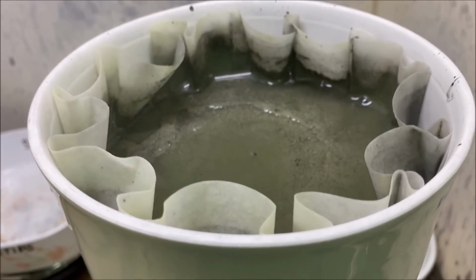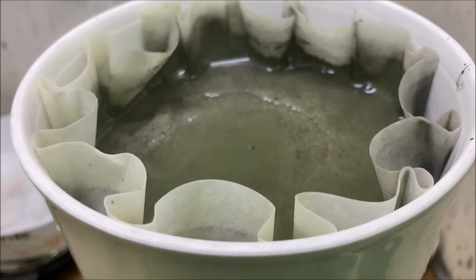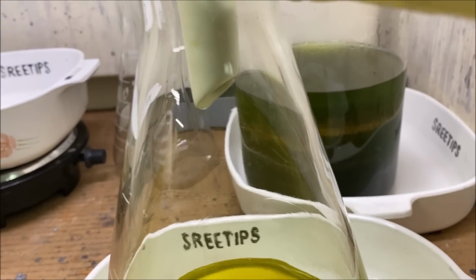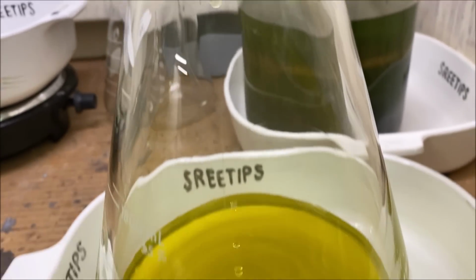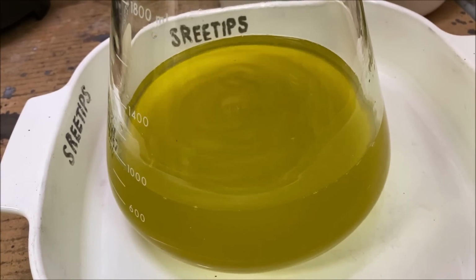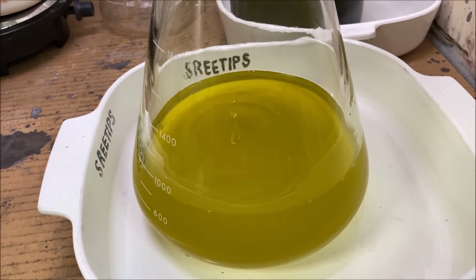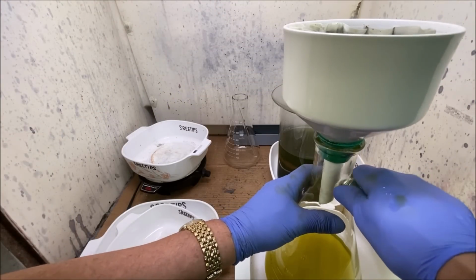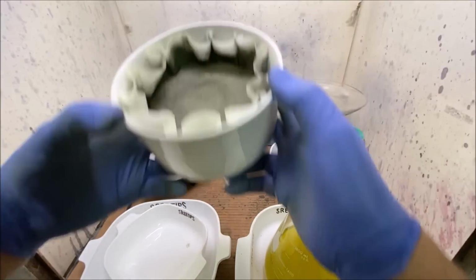I've got the solids rinsed, cleaned. That's some hydrochloric acid I poured in there. And if you look down below, you'll see that our filtrate is running crystal clear and colorless. So now we've got all the extracted gold down here in this solution in the bottom of this flask. I've got all this gold in solution down here from this second extraction.